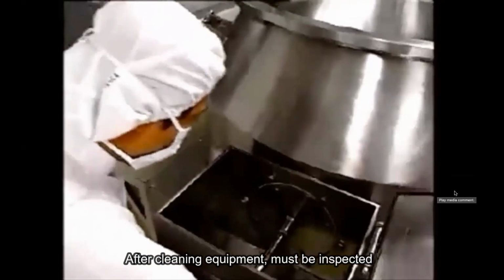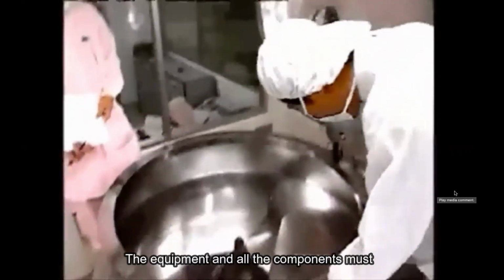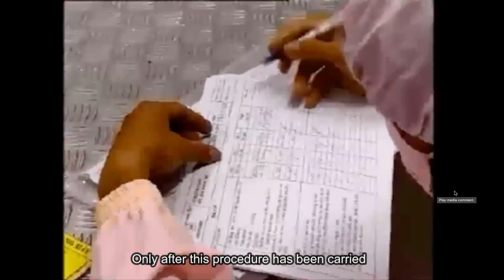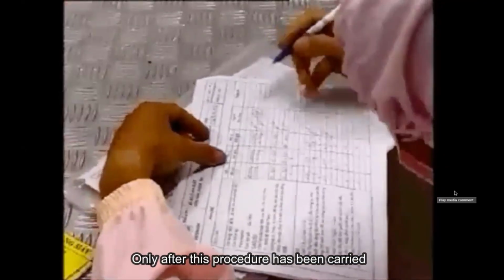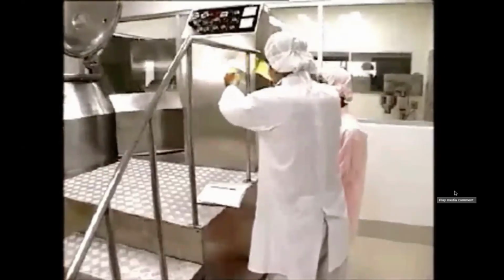After cleaning, equipment must be inspected by a trained and authorized employee. The equipment and all its components must undergo an intensive examination. Only after this procedure has been carried out may the required paperwork be completed and the equipment released for reuse.